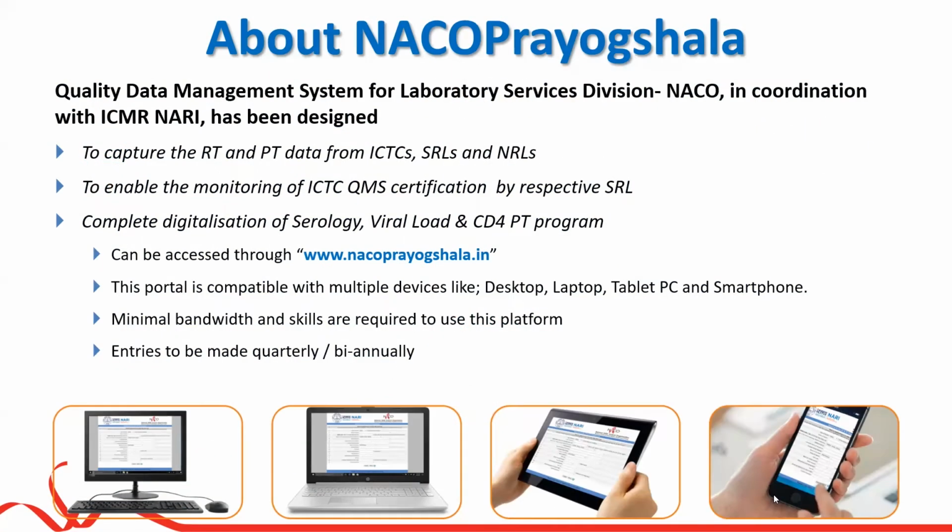So how is the NACO-Prayogshala accessed? To access the NACO-Prayogshala, we have to type the web address in the web browser. Any web browser you can use. So www.nacoprayogshala.in is the web address to be entered into the web browser, and the portal will open.